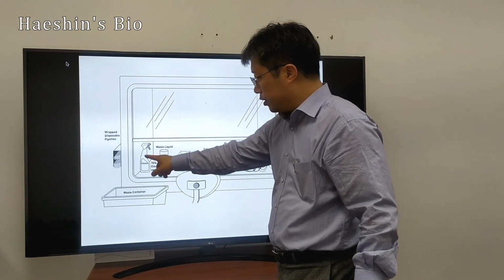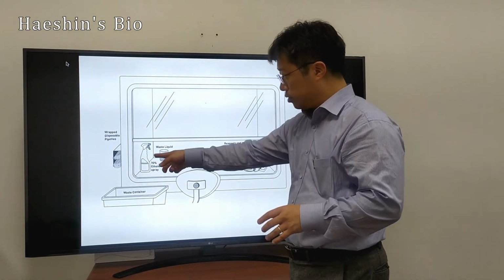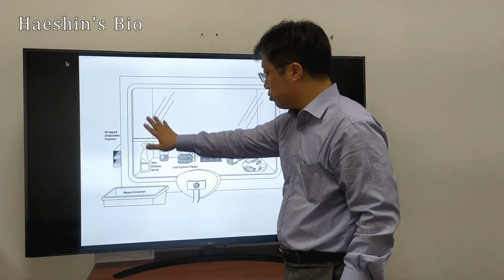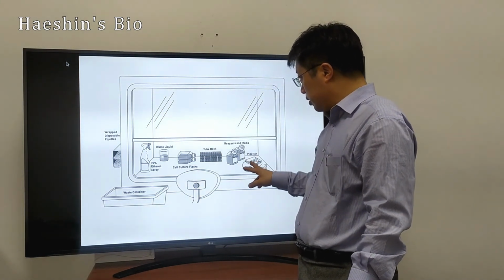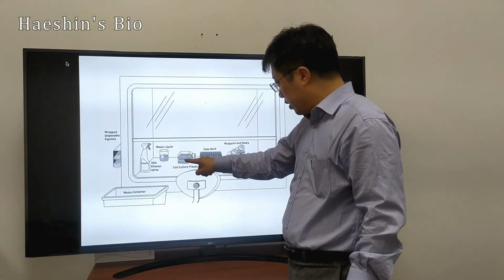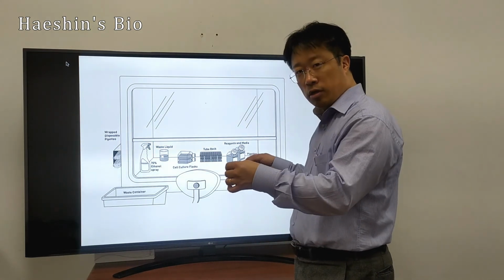For sterilization, use 70% ethanol. When you sit there, you take this and spray, and you get sterilization, also inside and outside here. When you change media, you use a pipette, say a 10 milliliter pipette.